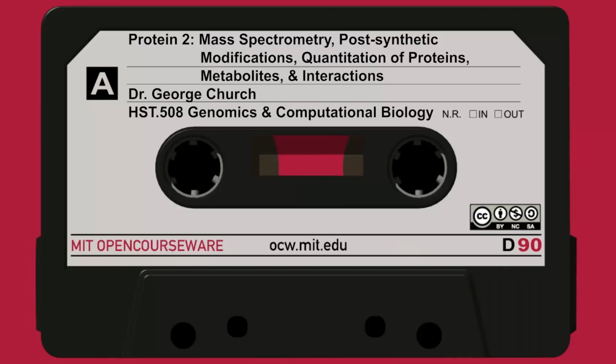Now here's where the tandem mass spectrometry, or MS over MS, or collision-induced dissociation comes in. Here's your ion beam of molecular peptide ions. You now turn peptides in, they're each on their own little space. And in the middle of this quadrupole, this magnetic environment here, you bring in an inert gas like argon to collide with these rapidly moving ions, and they will break the chain basically at any covalent bond.